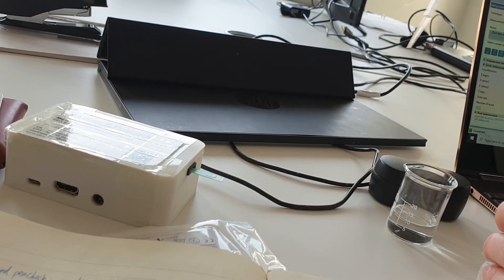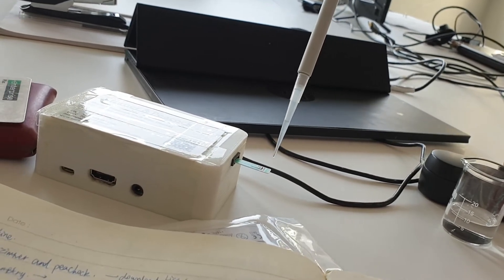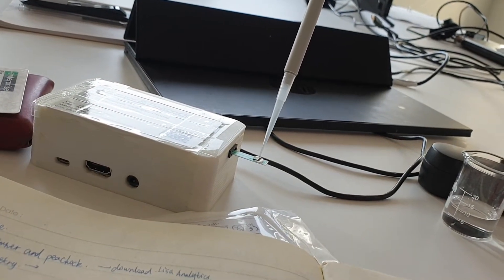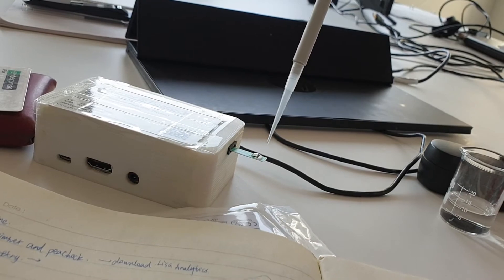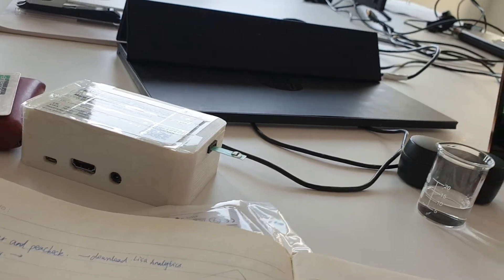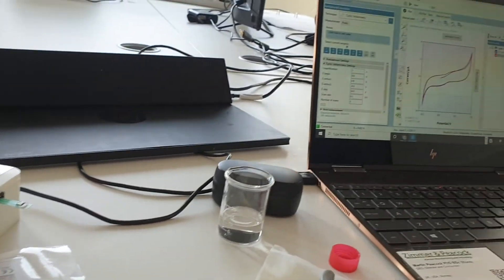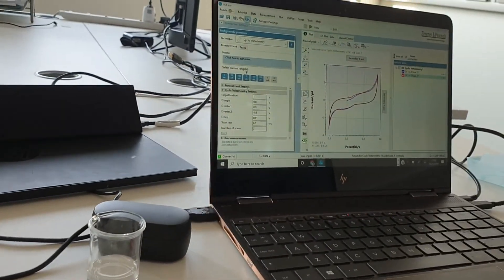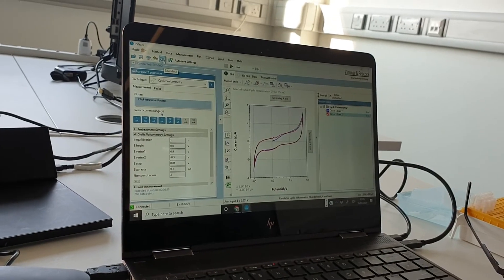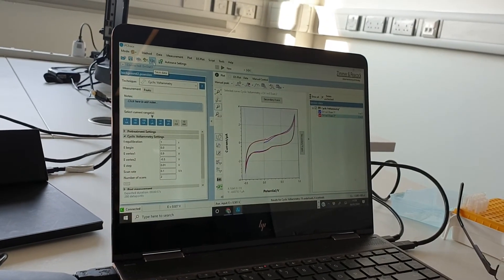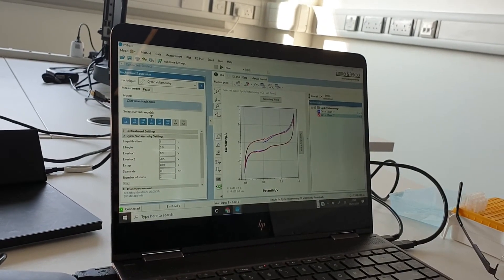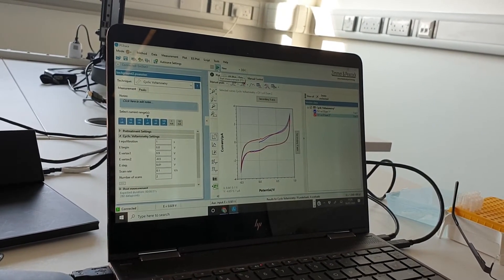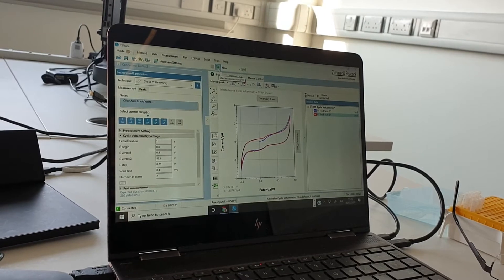I would normally save my data, so if you want to save data just go save data up here and you can save the data. I'm not going to save my data today. I'm just going to discard that.